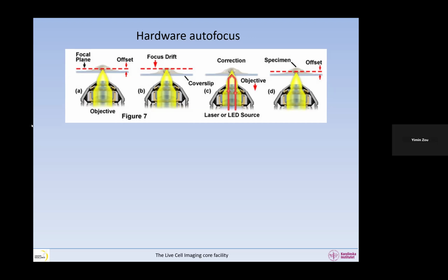So one of the assignments that you have. We are using the same microscope system, so I know that we don't have autofocus on the hardware. We have it on software, but not on the hardware, so we cannot use that. So how do you know that you do not have it? I asked the person in charge. Yeah, actually, this is pretty much the only way to know, really. And actually we don't use it because it doesn't work well.